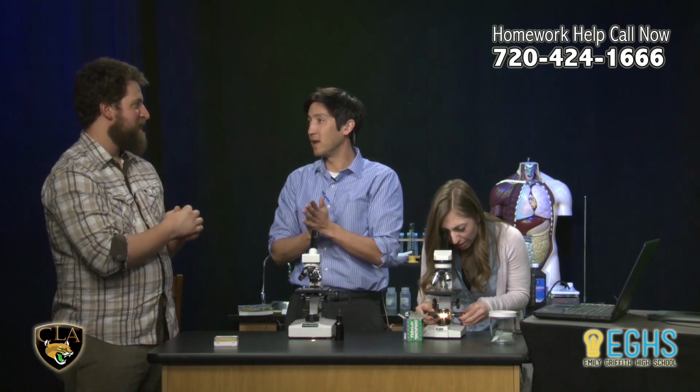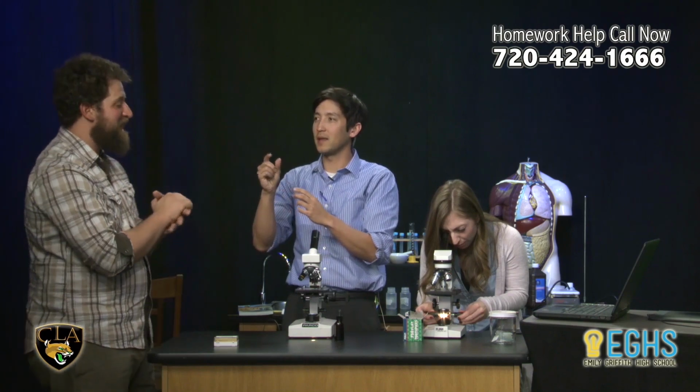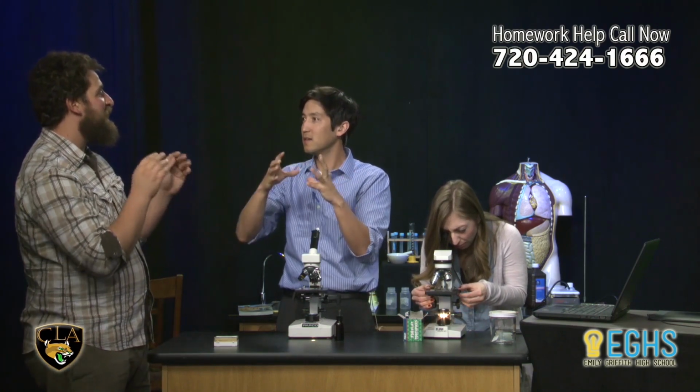There's a needle on it, and is that blue dot for size, or to give you a reference for size? No, that's for lining up the location, the position.